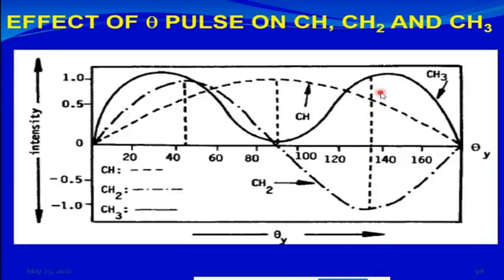CH and CH3 will give positive signals, CH2 will give a negative signal. Negative signal means in the negative phase, below the baseline, right? And for quaternary carbons, the amplitude, the intensity does not change throughout. You would wonder why we don't see any quaternary carbons. So the quaternary carbon remains on this baseline throughout the experiment. So it's here and you don't see it.